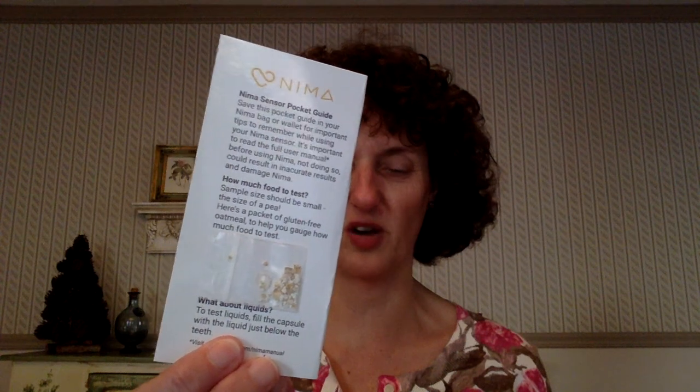I'm going to be talking with you today about testing gluten-free foods for spotty gluten contamination, like you might find in a restaurant setting, using the Nima. Before we get started, I'd like to remind you about the amount of product that the Nima team says you should use in a Nima capsule to test your sample for gluten. This is considered a pea-sized amount. It is a very, very small amount.